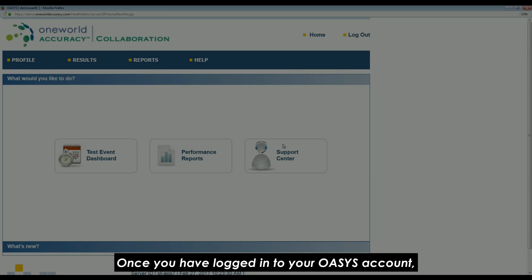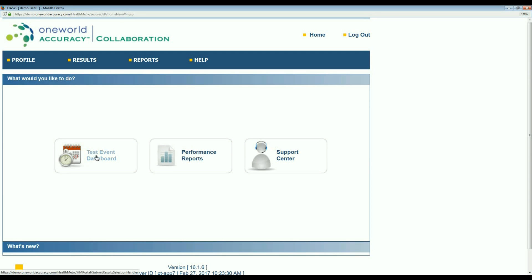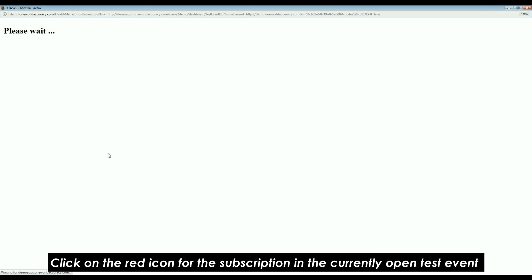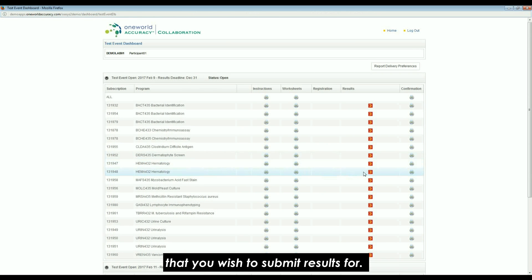Once you have logged in to your OASIS account, click on the test event dashboard icon. Click on the red icon for the subscription in the currently opened test event that you wish to submit results for.